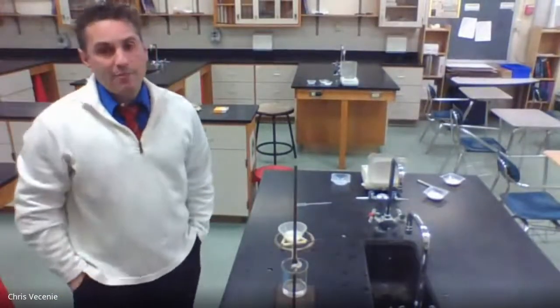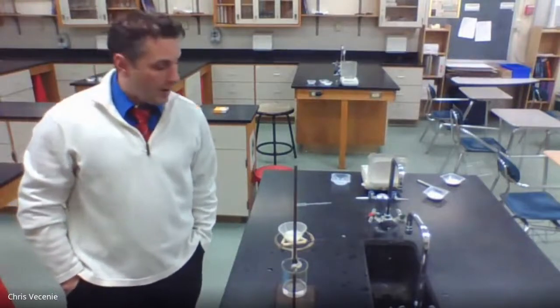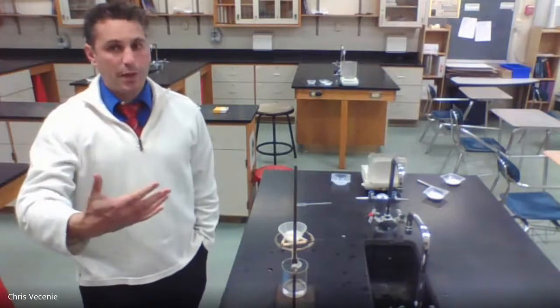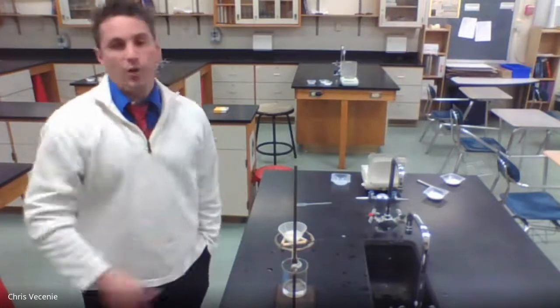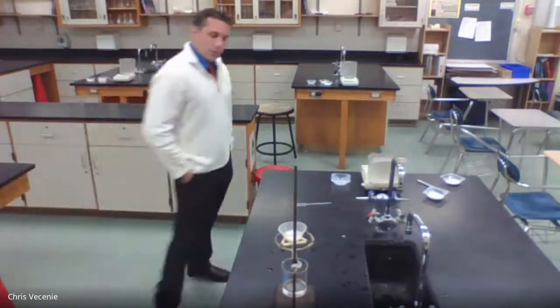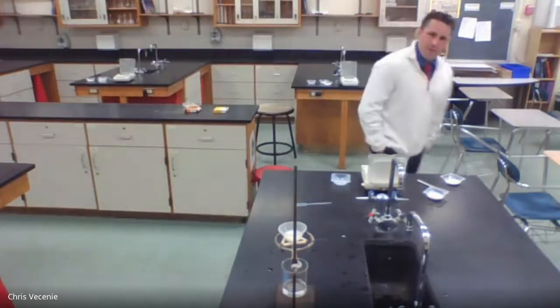usually about 8 to 10 minutes in there is enough to evaporate out any of the water that is there, getting us back to the filter paper, which we had at the beginning, but now there'll be some white solid on it. All right, so it looks like it's got just a couple more minutes till we get to that point, and then we'll get it back in the oven.